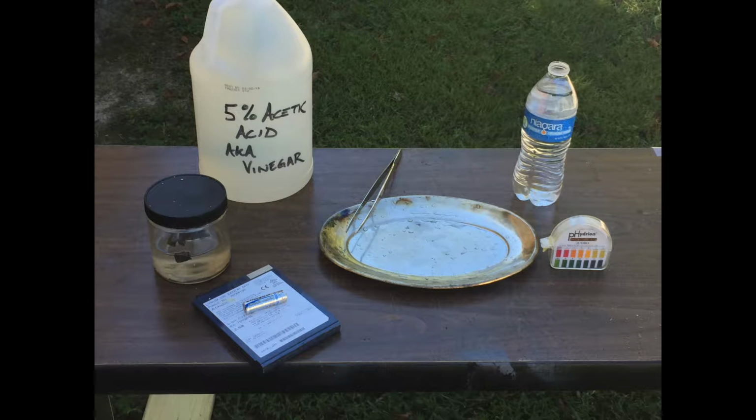First, we will react lithium metal with water. This chemical reaction will produce 3 things: flammable hydrogen gas, heat, and lithium hydroxide as the residue left in the pan. Since we are using thick cuts of lithium, it will not react fast enough to generate sufficient heat to ignite, but if a spark were to be present, the hydrogen gas would ignite.